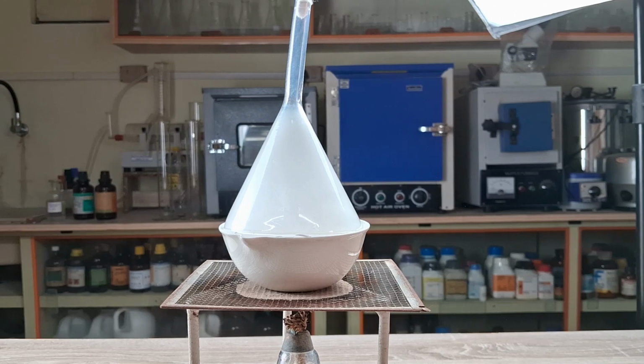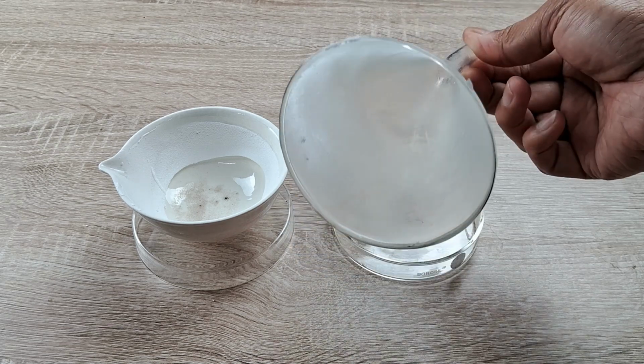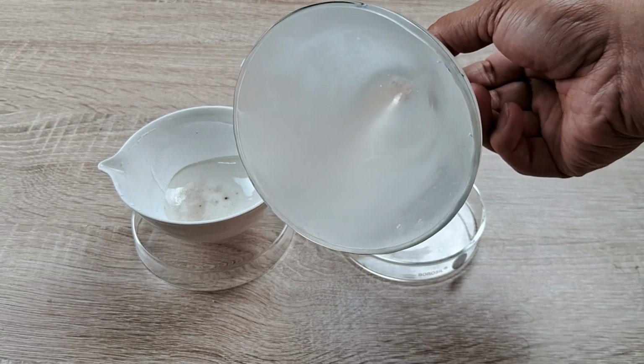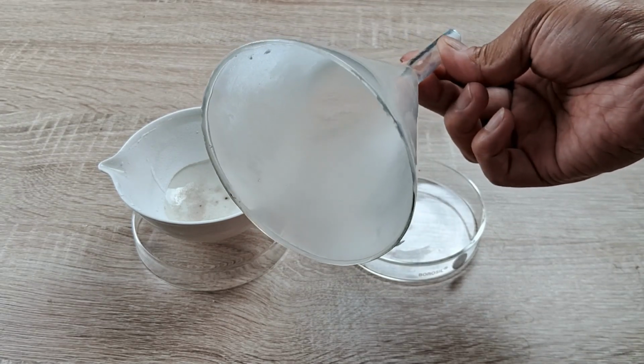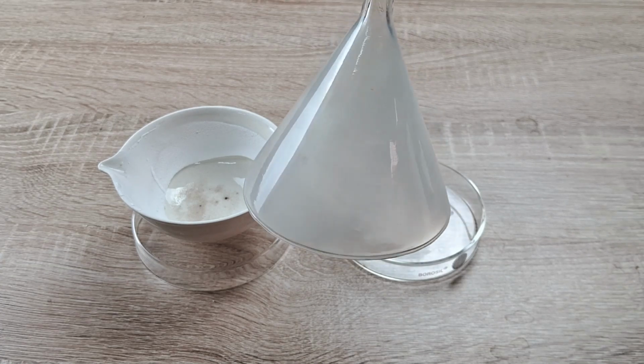Meanwhile, throughout the inner walls of the funnel, which is comparatively cooler than the porcelain dish which is being heated, thick white deposits can be seen forming. At the end of the reaction, you can see that all the solid ammonium chloride crystals in the china dish had disappeared and are completely deposited as white residue on the inner walls of the funnel and even on the sides of the porcelain dish.